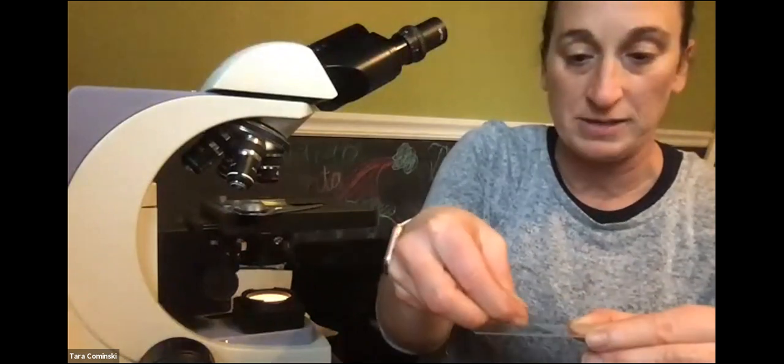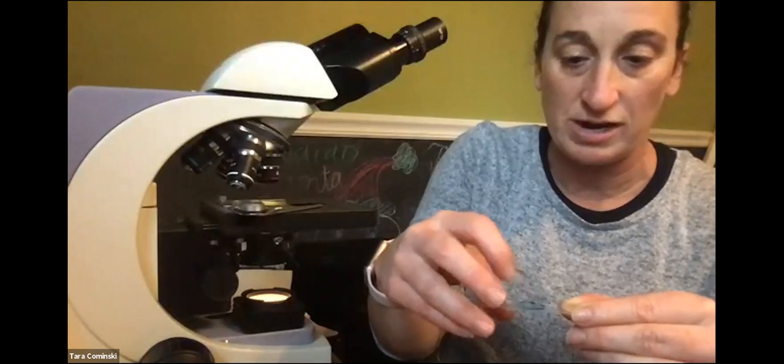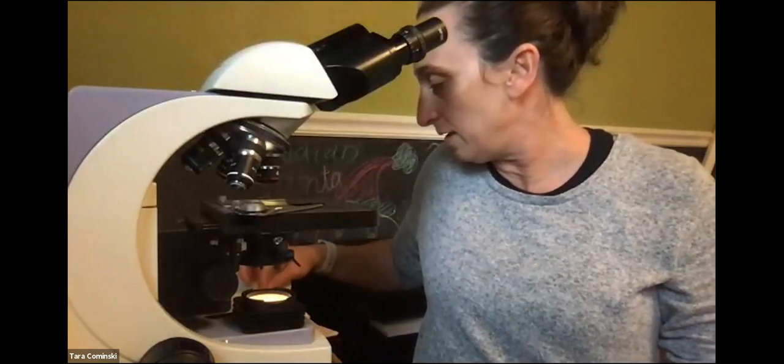All right, so cover slip on top. I'm gonna kind of push it down so I can try to get rid of some of the air bubbles. All right, and I'm gonna leave it on the side here. We'll see what it looks like.